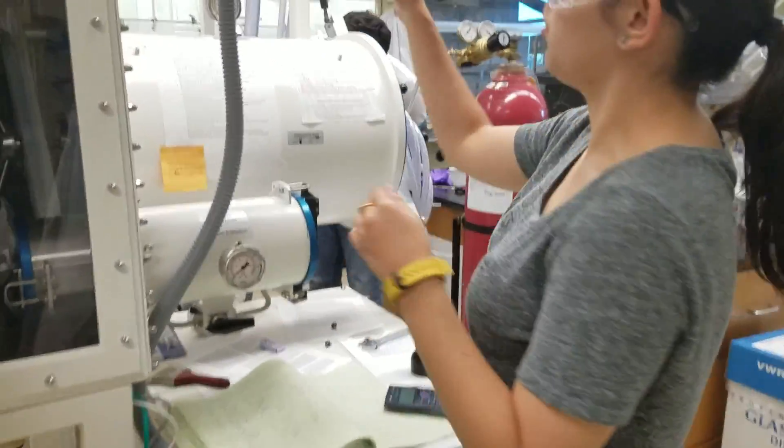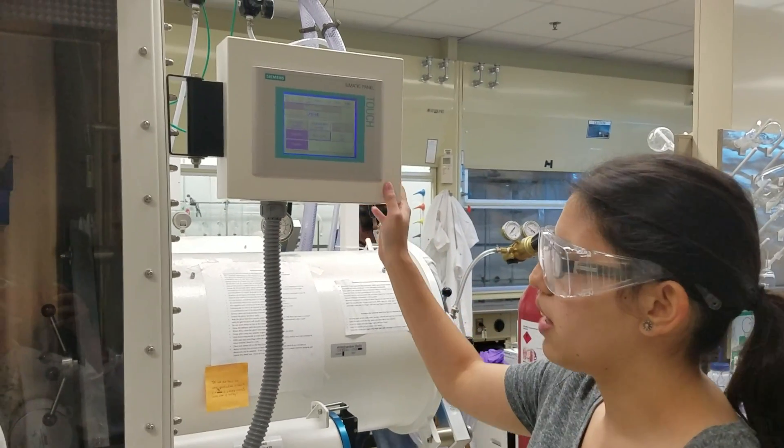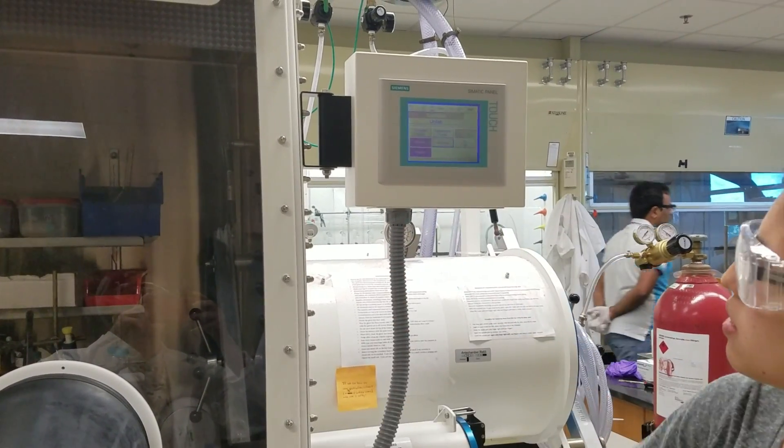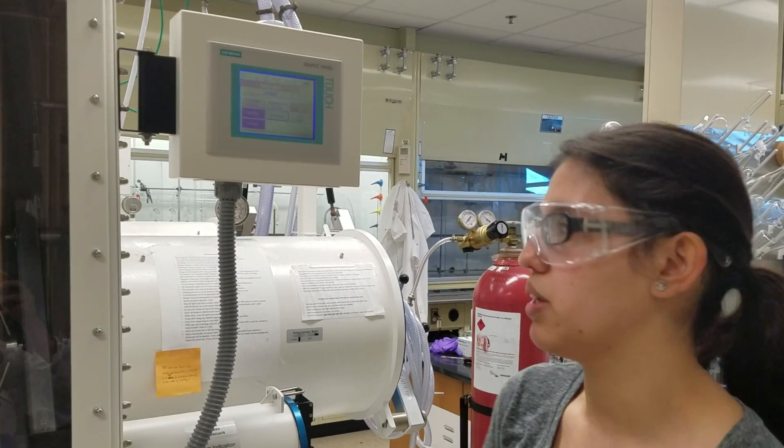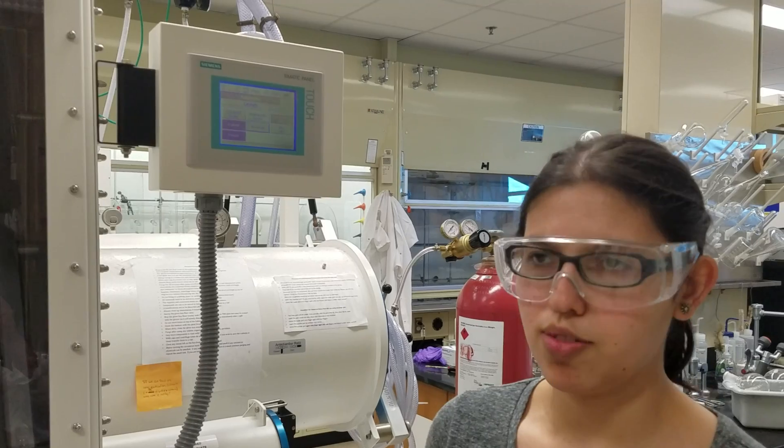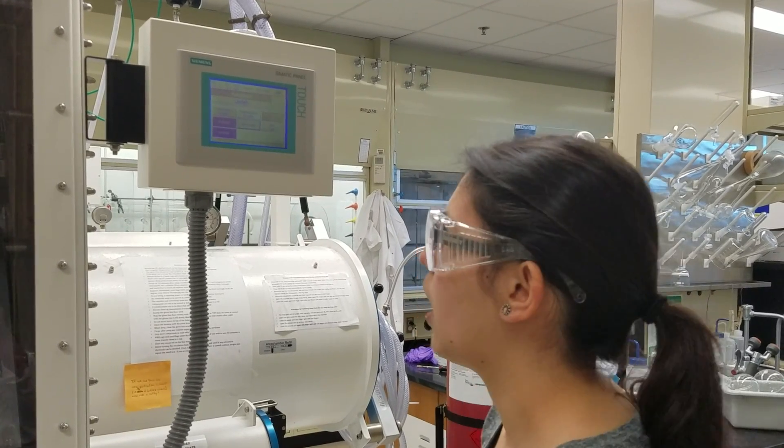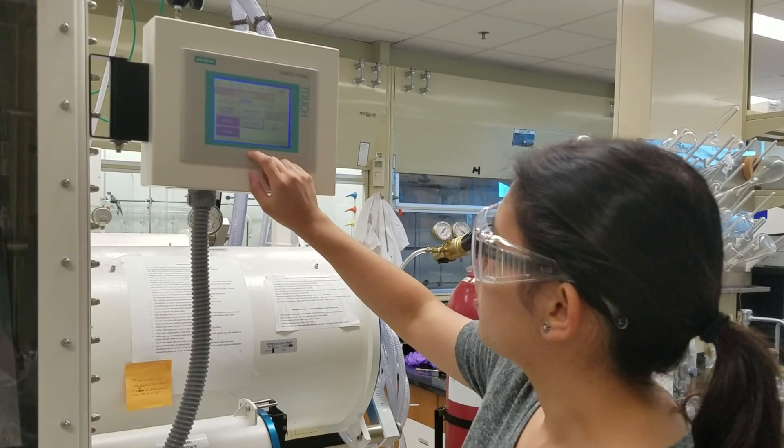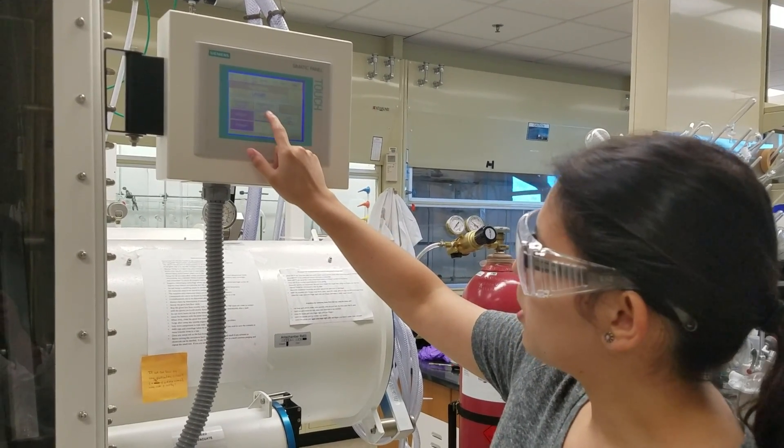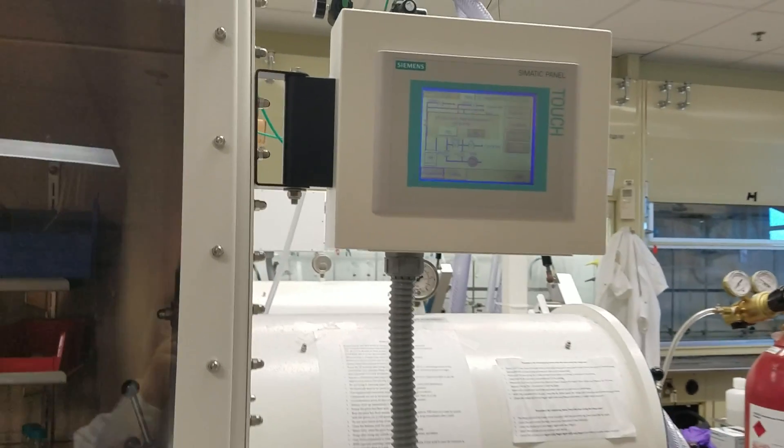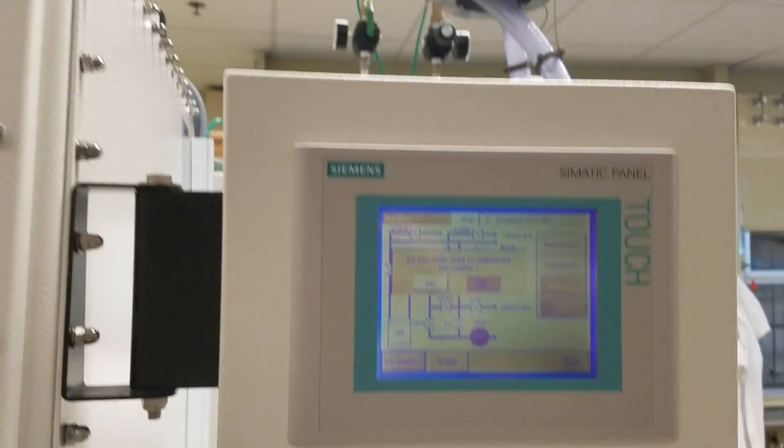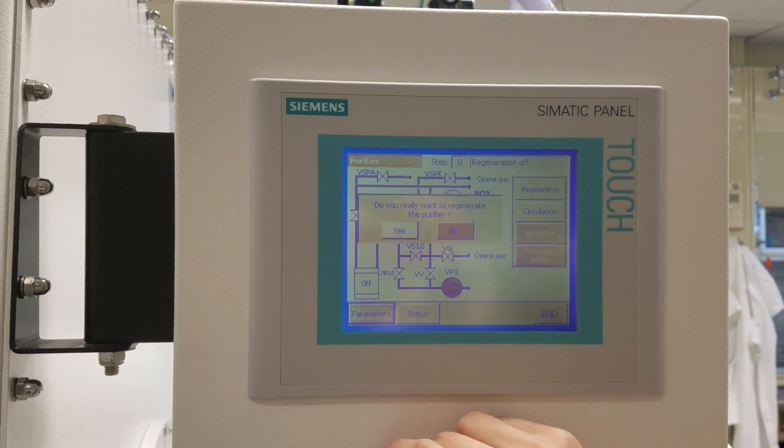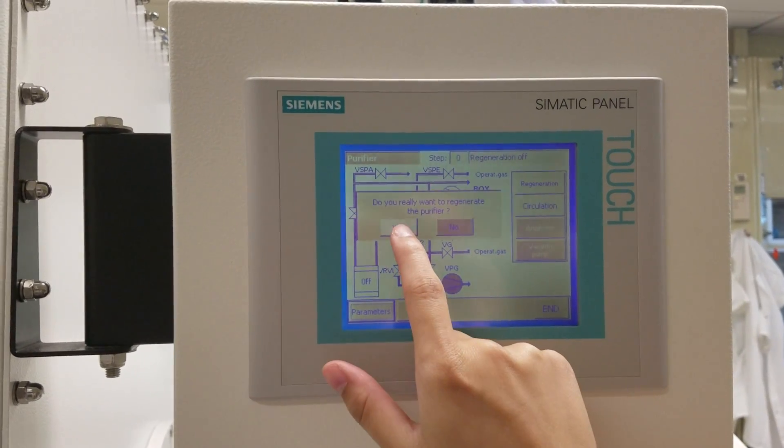So, to do a regeneration, you have to make sure that your glove box atmosphere is purged down to less than 0.1 ppm because it's going to stay with that atmosphere for 16 hours. You really don't want it to destroy the chemistry inside of the glove box. So, what you do is just go to regeneration purifier, upon which you'll see a window that says, do you really want to regenerate the purifier, you say yes.